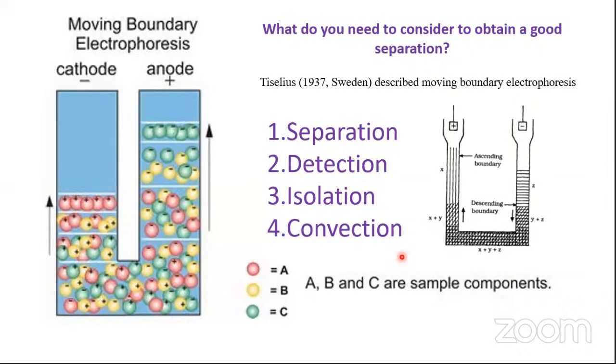And that may cause a further problematic situation in terms of separation, because the solutes are suspended in the solvent, and if the solvent is set into motion, the solutes' diffusion also changes. That means diffusion characters also change, and hence the sharp separation that you want will get disturbed pretty easily due to convection current. So although you are going to get some degree of separation, all these factors need to be paid attention to when you are looking at the free or moving boundary electrophoresis system.